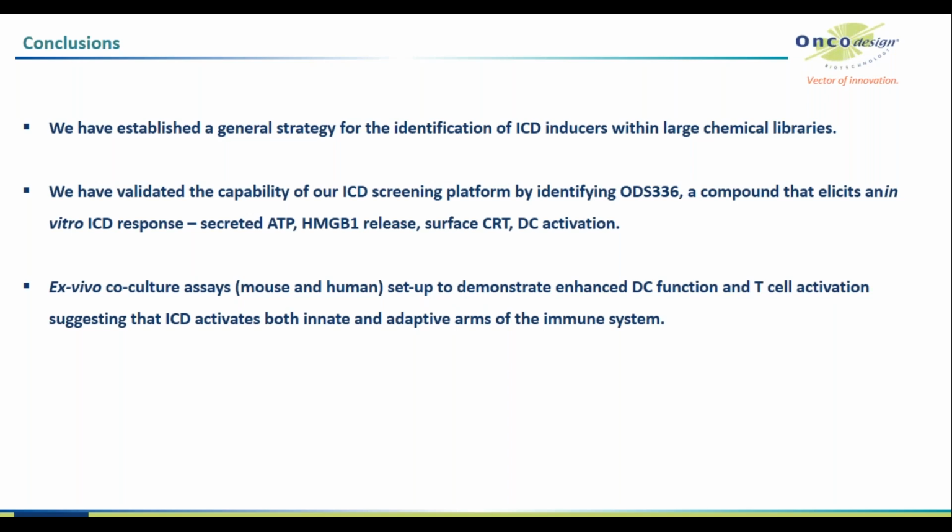We've also set up ex vivo co-culture assays for both mouse and human for the DC function and for the T cell activation. The mouse assay is done, the human assay is in progress, suggesting that the ICD activates both innate and adaptive arms of the immune system.